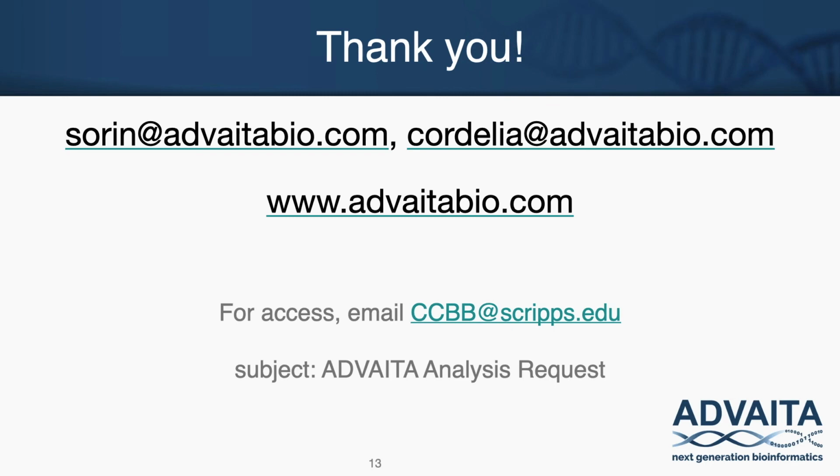And I can send out the example files along with the chart model and all the details once you send me an email to ccbb@scripps.edu. Yeah, between the two of us, we have a lot of resources for helping you get your data analyzed or formatted so that it can be analyzed properly.